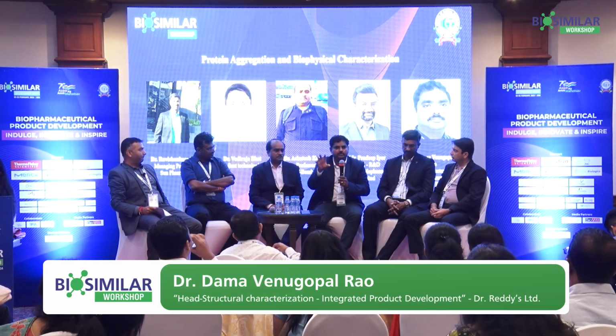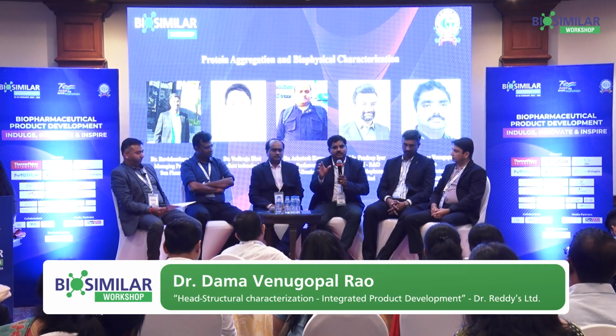See, this is, as Dr. Ashutosh as well as Navratna has explained, how to understand how closely you are to the innovator product, the DM values. We are close in numbers, you are very close to this. However, there are some challenges with respect to small molecules, like where there are some terminal amino acids like histidine, where small changes in the pH will cause a little bit of chemical shift change. So that is where it will definitely not fall within the 3.3 stated by the agency.